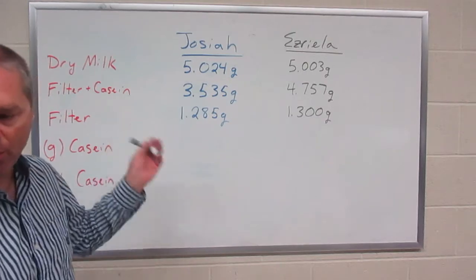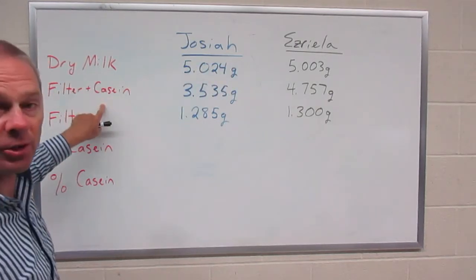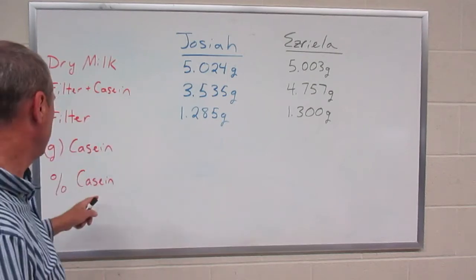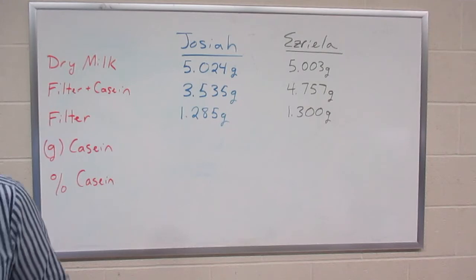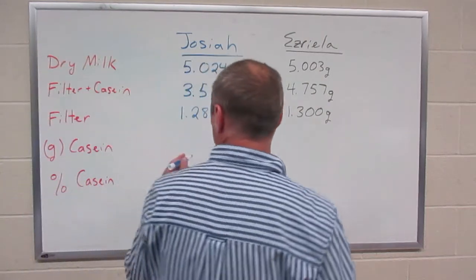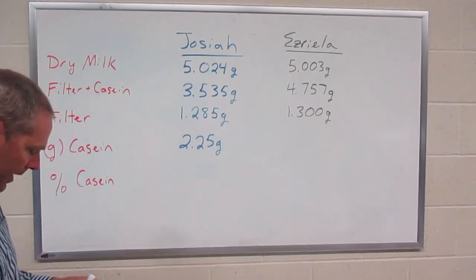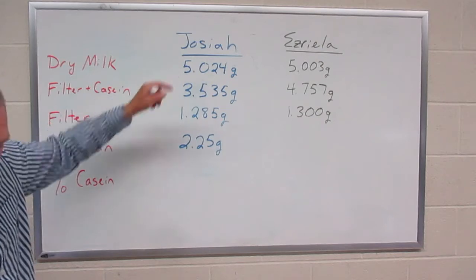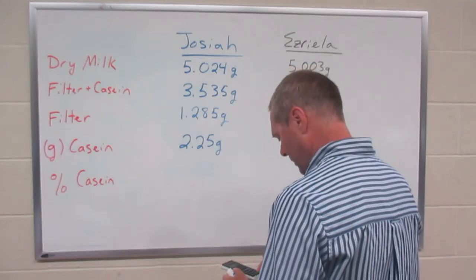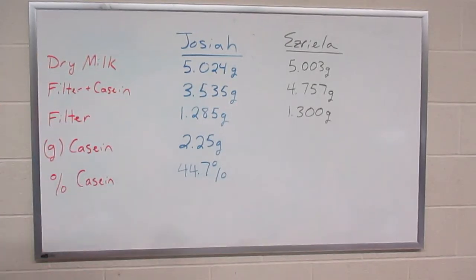Now what I have up here is the data from both Josiah and Ezreela. I have Josiah's on the left, Ezreela's on the right. I have the dry milk, the filter plus the casein after they performed the experiment and let it dry for 3 days, and the mass of the individual filters. So what we're going to do is calculate the grams of the casein as well as the percent of the casein. We start with Josiah's. We take the mass of the filter plus the casein and subtract the two. When we subtract those two, we get 2.25 grams of casein, which is what he had produced. If we take that 2.25 and divide it by the dry milk, we get 44.7% casein. So in his dry milk, he had 44.7% casein.